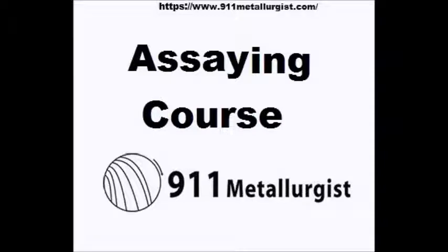The assay book. This is the official book, and is a combination of the sample and laboratory books. It corresponds with the report forms. Without being loaded with detail, it should contain sufficient to characterize each sample. Illustration. Example of page of assay book.